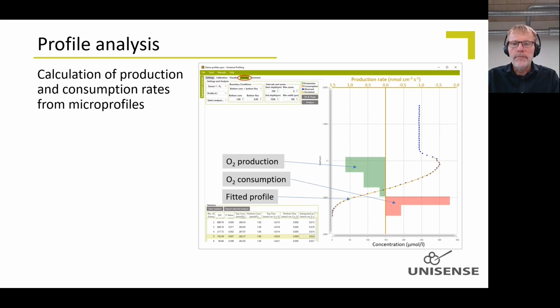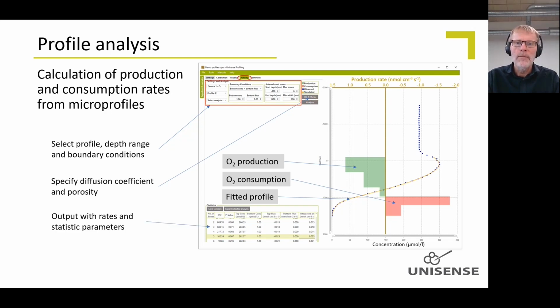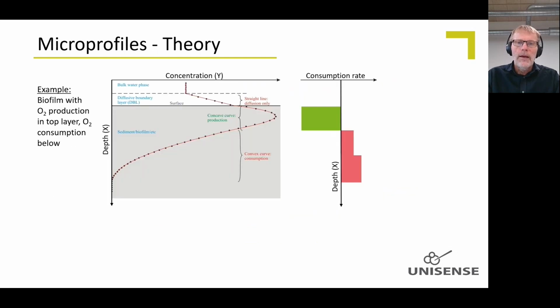You will need to define a number of variables, to lock some boundary conditions for the software to work. And you will also need to specify the diffusion coefficient and the porosity of the sediment for this to work. I showed this yesterday, I'll just go through it again.